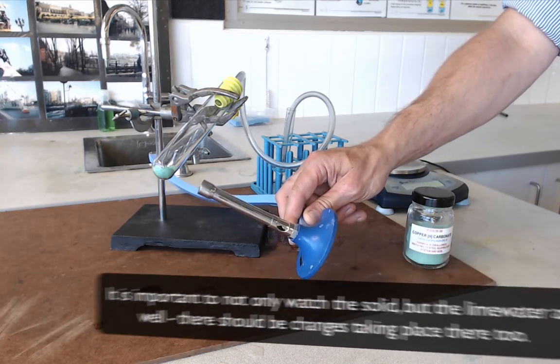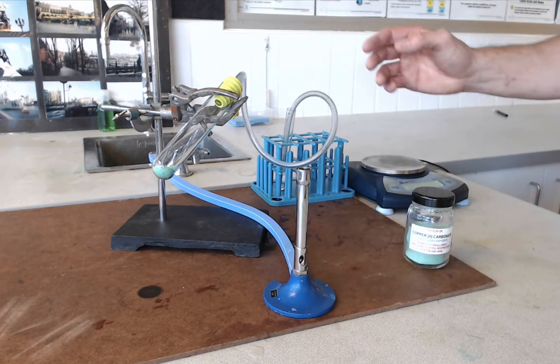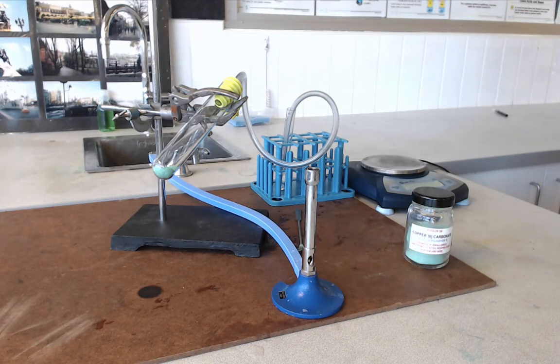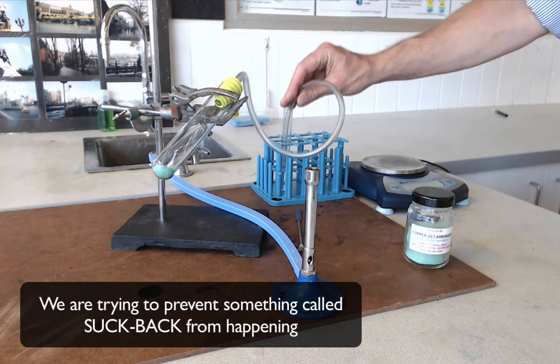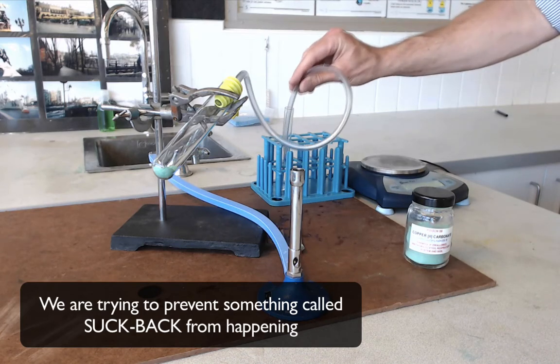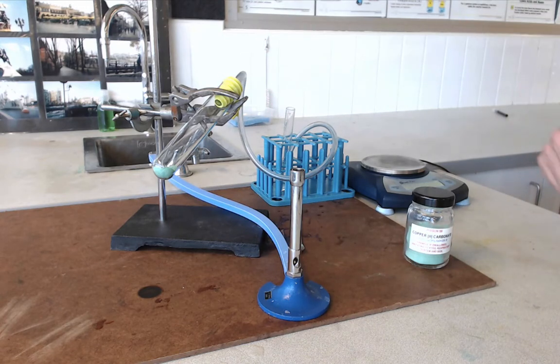You will soon see the solid starting to turn black and gases will start coming through. Some gases will be produced by the reaction; others are simply existing gases inside the tube expanding from the heat and escaping through the lime water. It is very important that we don't allow the gases in this tube to contract while the delivery tube is still in the lime water. Heat steadily until all the solid is black, then before you stop heating, remove the delivery tube from the lime water. This prevents the gases contracting and sucking cold liquid back up into the hot tube, which could cause the glass to shatter.